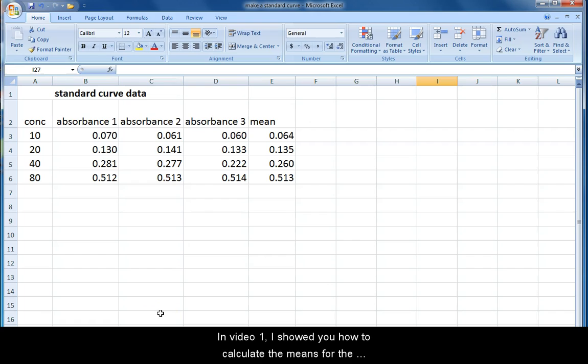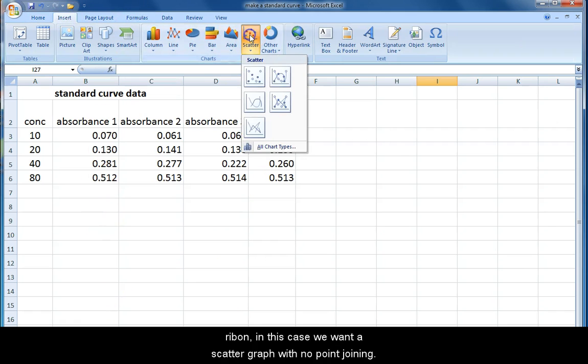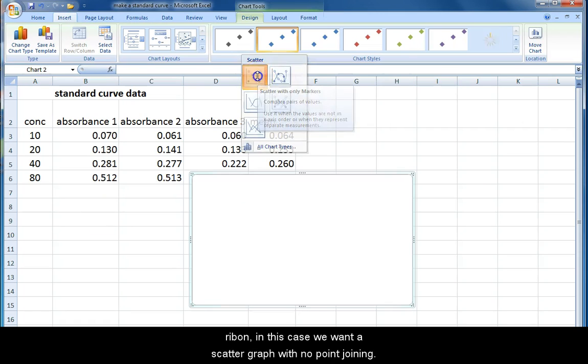In video one I showed you how to calculate the means for three absorbance values. Now we will make the standard curve. Start by selecting the type of chart you want from the insert ribbon. In this case we want a scatter graph with no point joining.